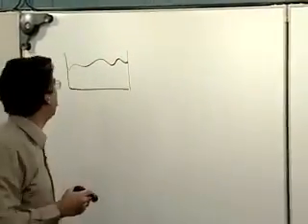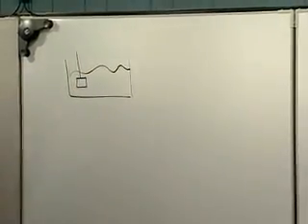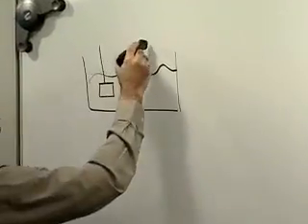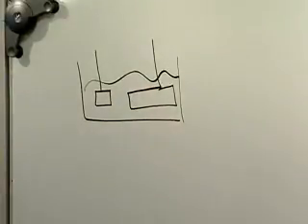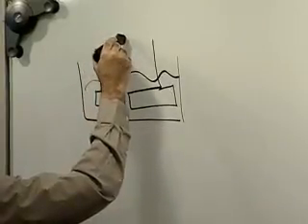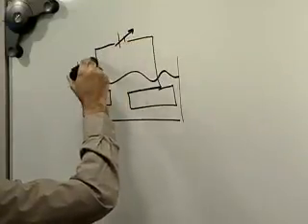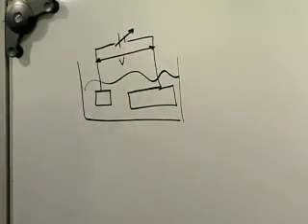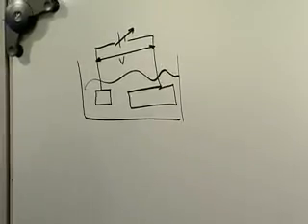And you have a sheet of platinum. And so what you might do is you might cut two electrodes out of the platinum. Maybe one looks like that. And you're not too careful about this because you're locked in a closet. And so the other one looks like this, maybe. And then you would take your power supply, and we'll give you a variable power supply, so you have a little knob on it. You can change the voltage, and you'll drop a voltage across your two electrodes in the hope that some chemistry happens, some electrochemistry happens.